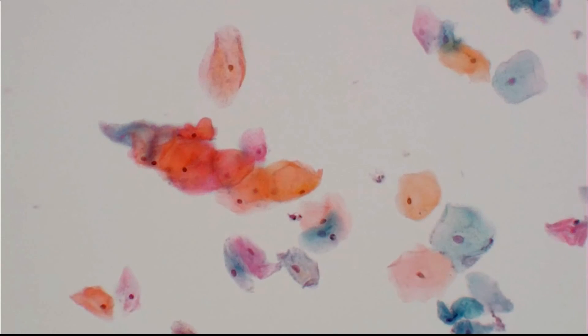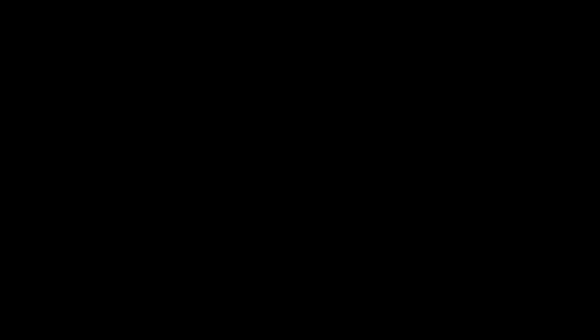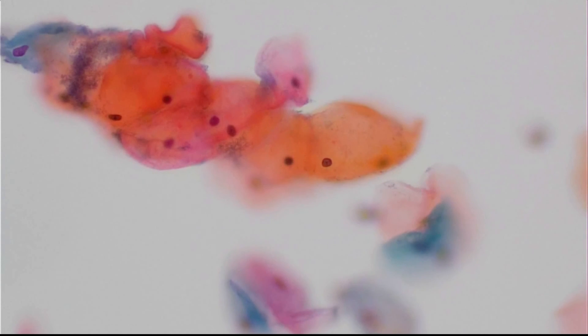If we drop back up to higher magnification, once again we can see the detail that's required in helping to make a reasonable diagnosis.